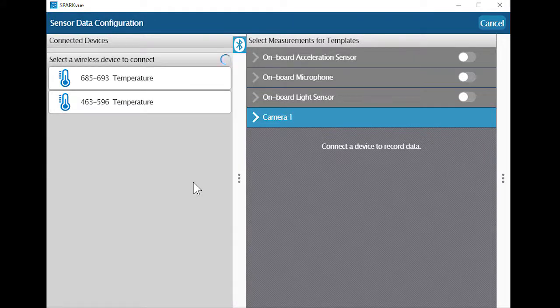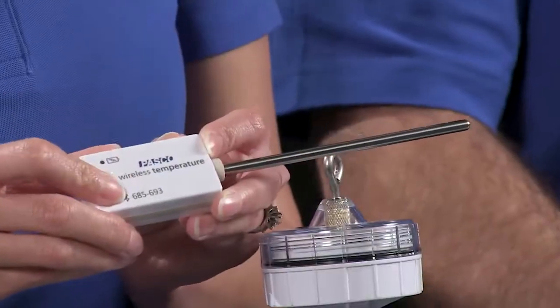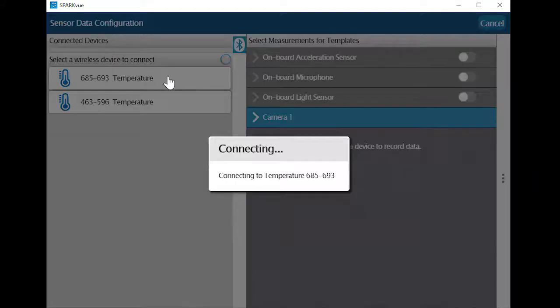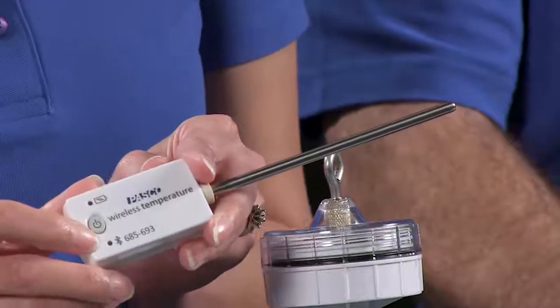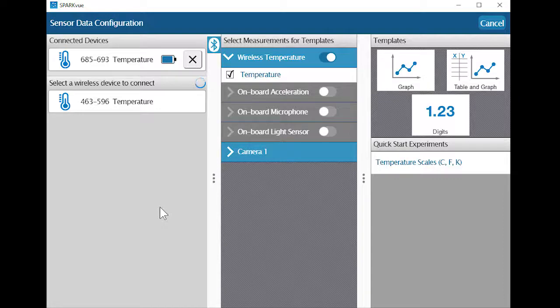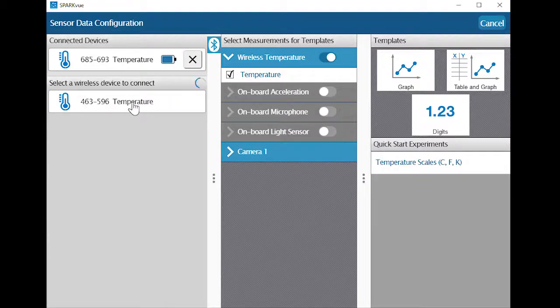I see 685-693 at the top and that matches the ID number printed on the sensor closest to me. When I'm ready to connect, I just select the sensor from the list. When a sensor is connected to a device, the red flashing light on the sensor changes to a green flashing light. In SparkView, notice how the temperature sensor is now identified as a connected device and is no longer available in the lower list. Our other temperature sensor remains available to connect and I can connect to it or additional sensors by clicking on it in the lower list.